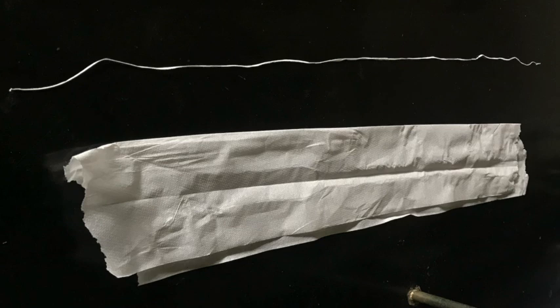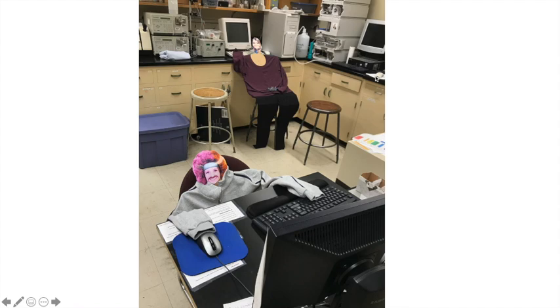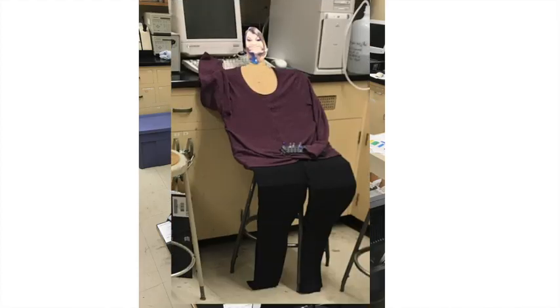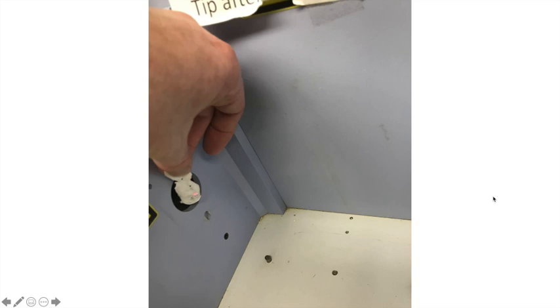If I wait a day or two, it'd be extra dry, but I went ahead and took the spectrum of it right away. And I went into lab and there were a couple students in here. We got Sid at the computer taking an NMR there. And Cassidy's back here. She's running samples on the HPLC, maybe some diet soda samples. So we had a couple students in lab that day.